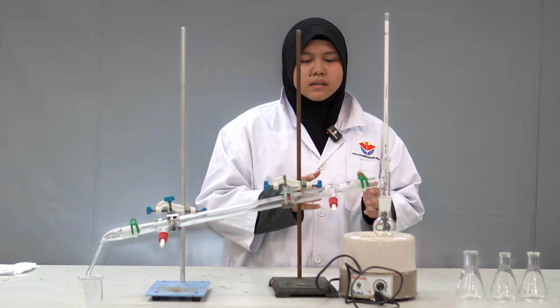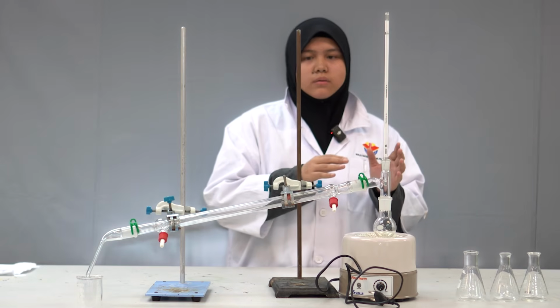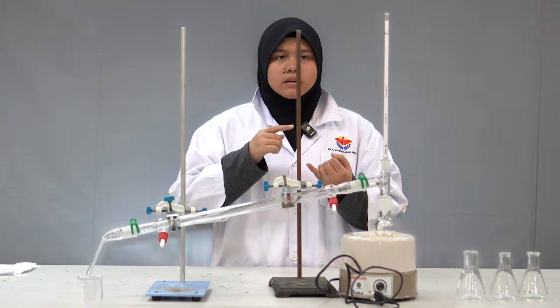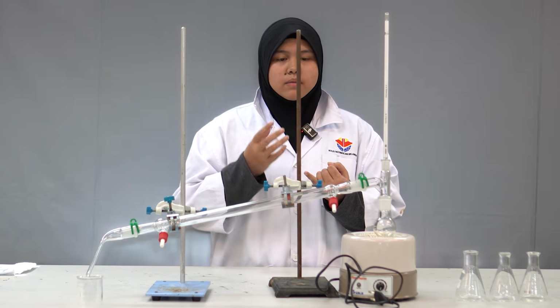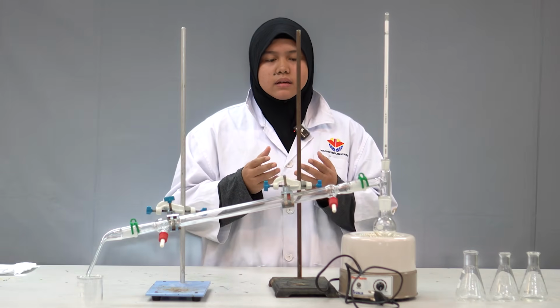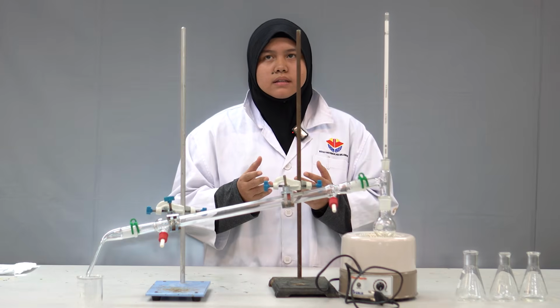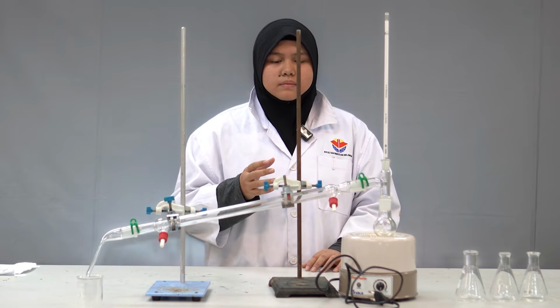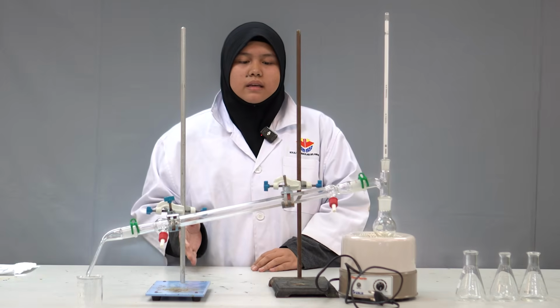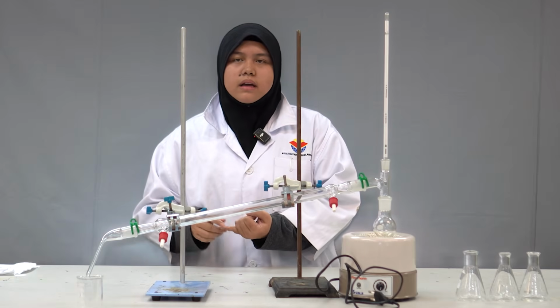In steam distillation, we boil the water first, and the steam from the boiling water goes through the pot. The pot has the plant that you want to extract the smell oil from, and the steam carries the smell oil from the plant to the condenser, and then becomes liquid, giving oil and water.